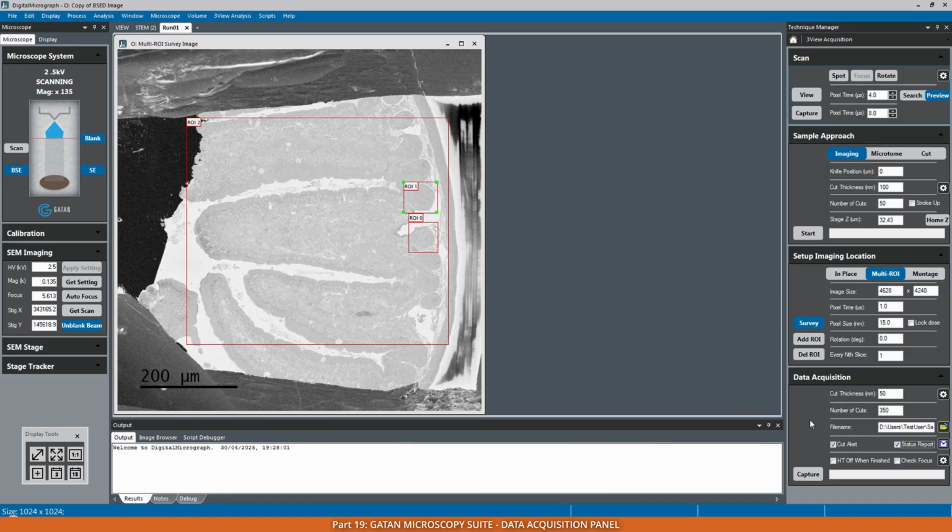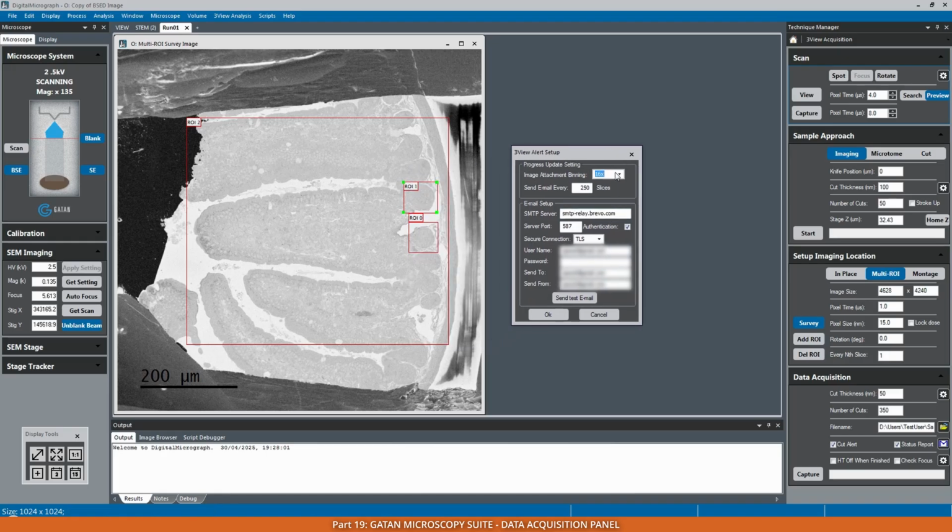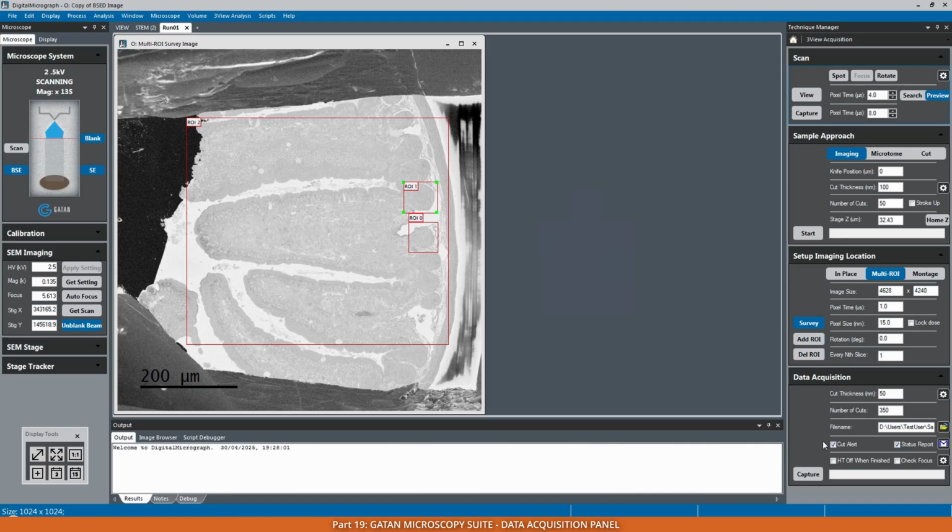You can define sending status reports. Well, usually you need to, there's a way you can do that. It sends this downsampled snapshot, but you need to specify the SMTP server, and you can use this SMTP relay from Brevo.com. You just create an account there, it gives you the password, and you can just send it. But yeah, change it to your email.